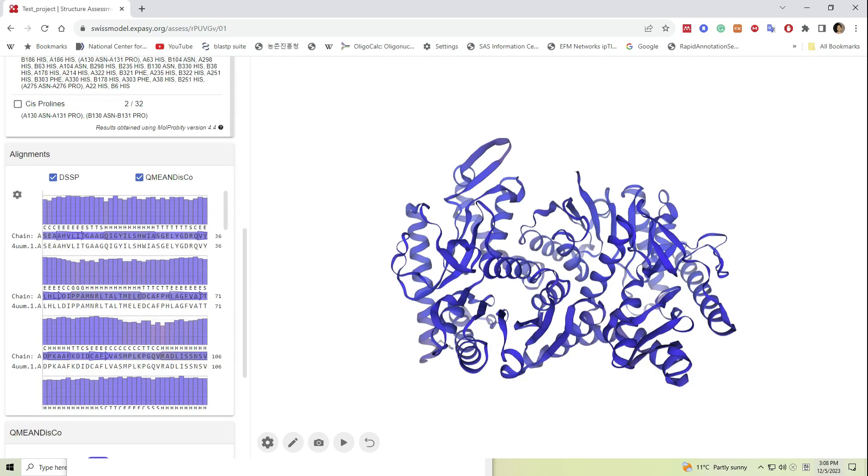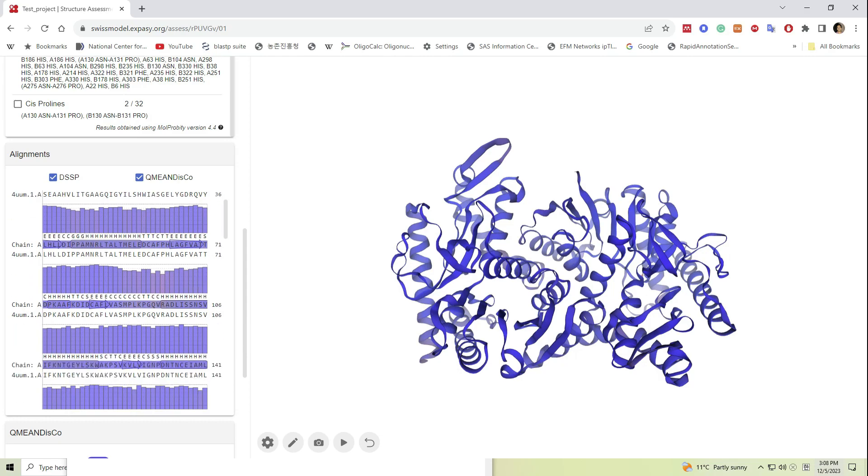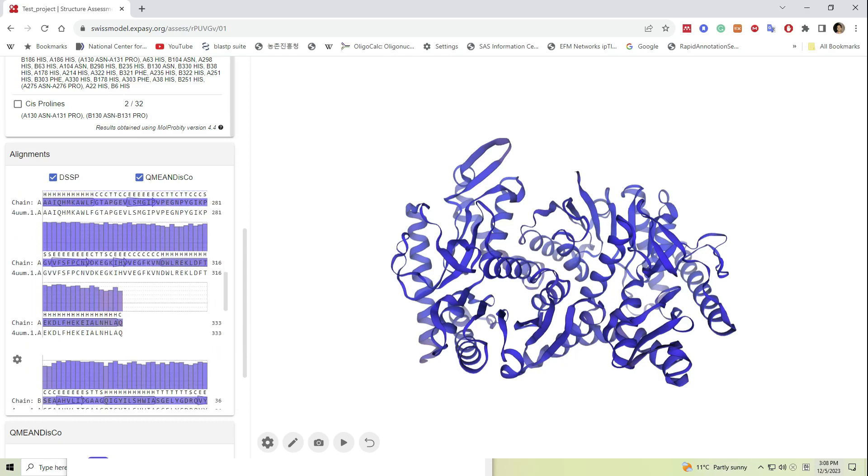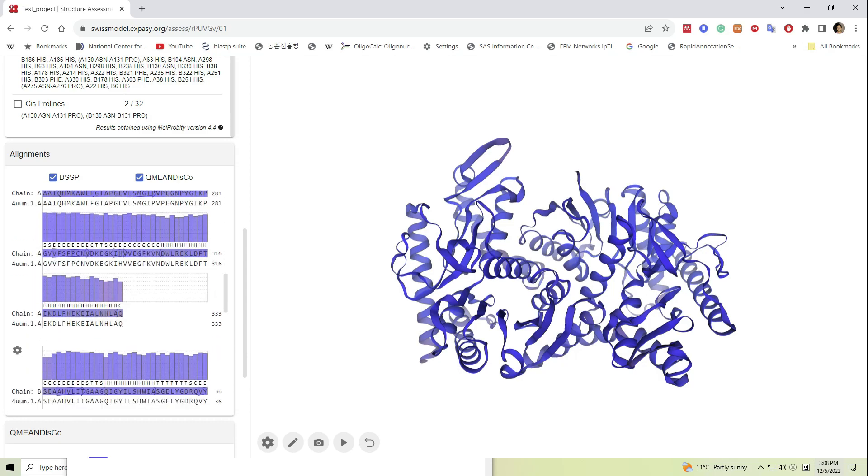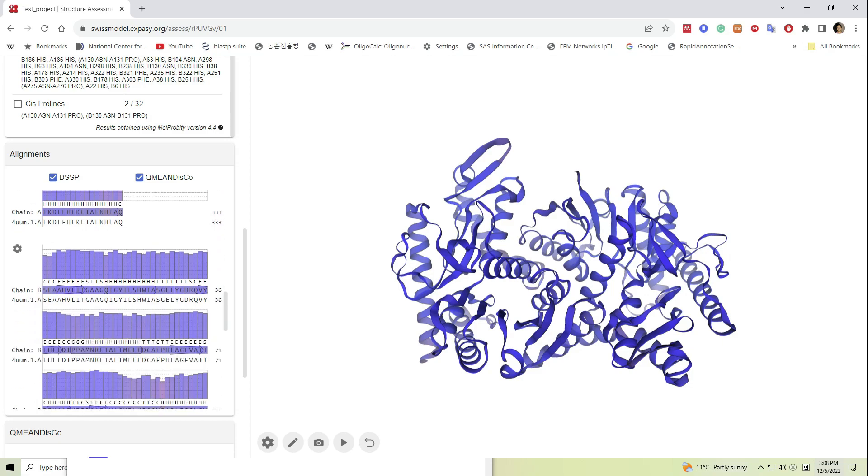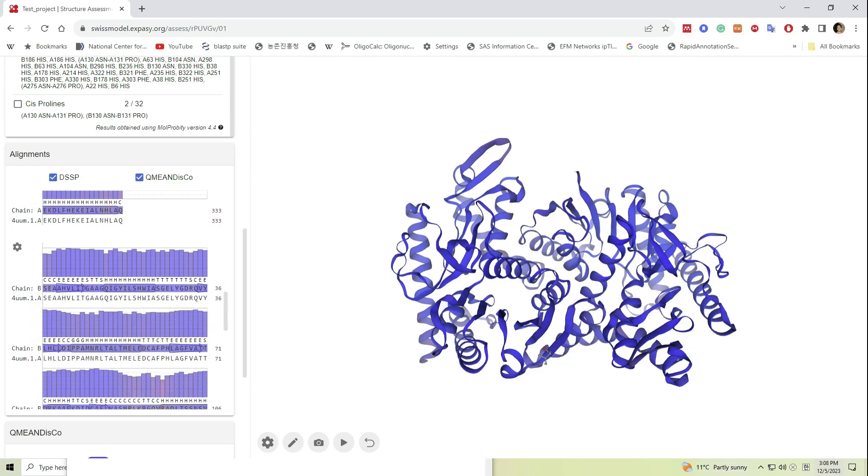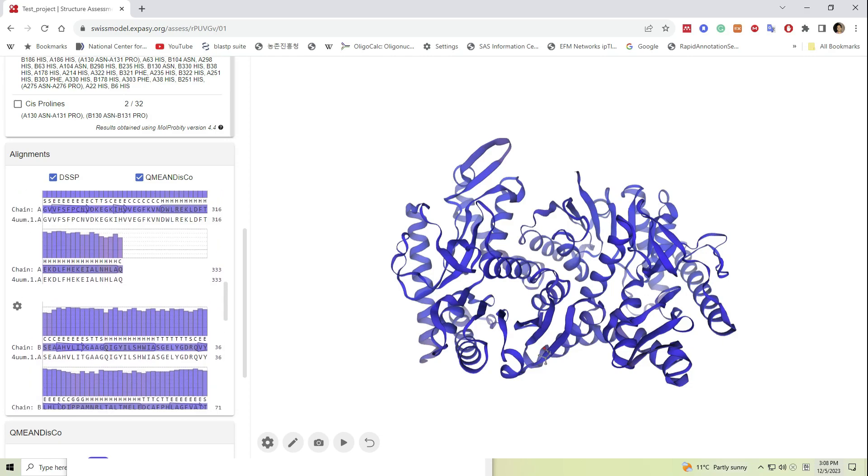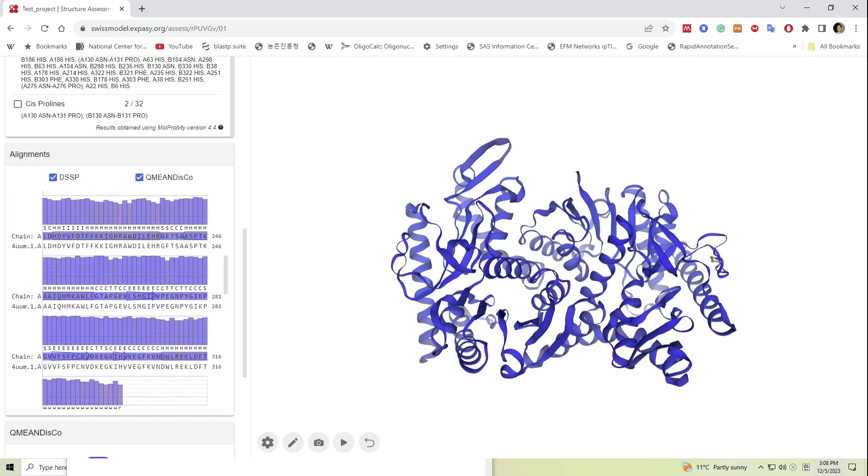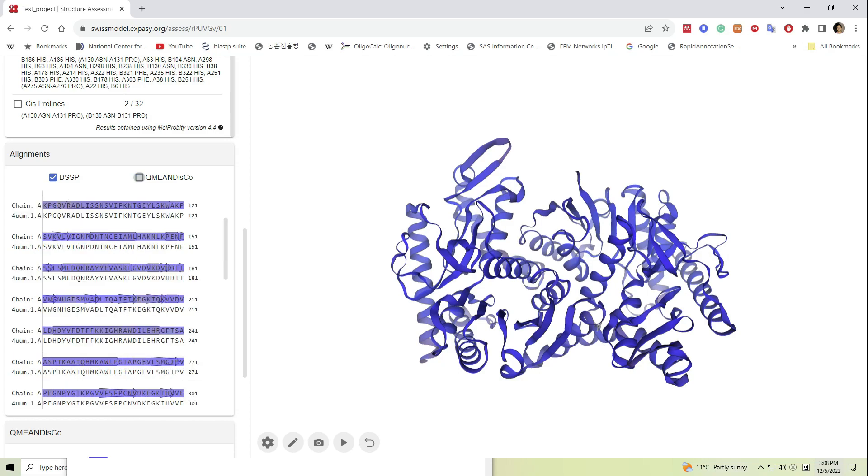The sequence alignment graph provides the alignment details of the model against its template and color coordinates. The color indicates the confidence of the developed structure by displaying the QMEANDisCo scores.